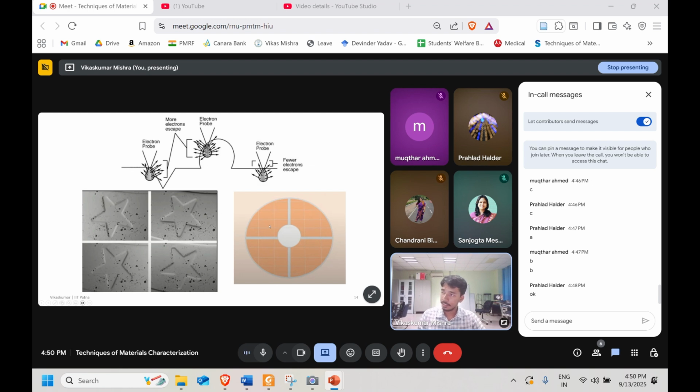First, let's say this, the second one is over here, the third one is over here, the fourth one is over here. Now someone wants to see the topological information more enhanced. In that case, they will add these two detectors, combine these two detectors and see the image. In that case, this will be enhanced further.